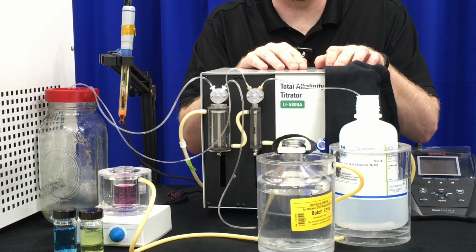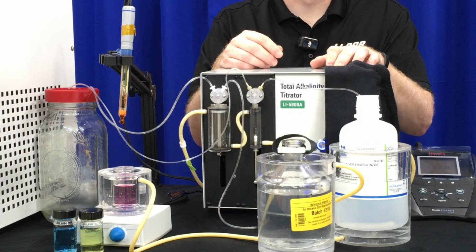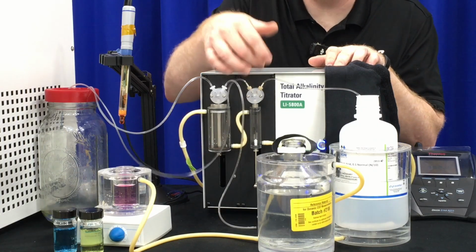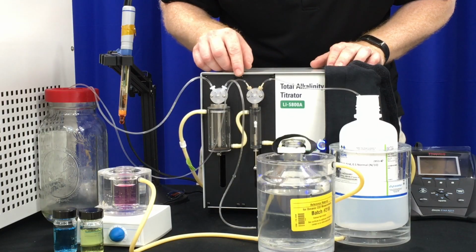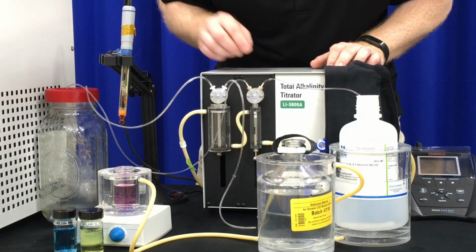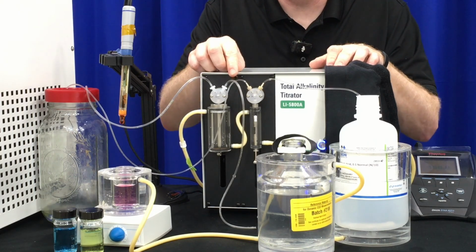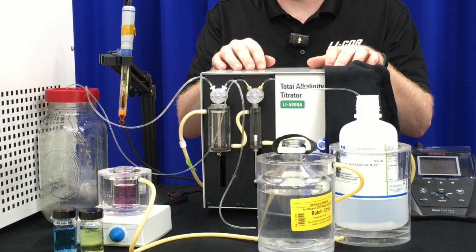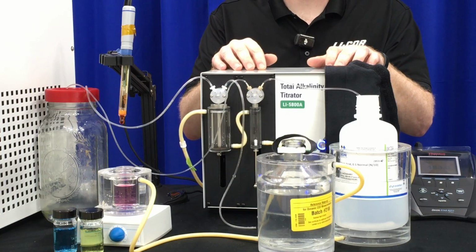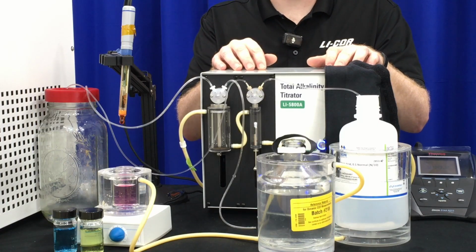And the syringe will flush with acid. As you see, the syringe is filling with acid, but there is an air bubble from the air that was in the tubing. And then it is dispensing into the waste container, but you'll end up with bubble lines in that line as well. That's why we do 2 flushes. The second flush removes all the bubbles out of the lines. As you can see, the second flush is now pushing everything through and out into the waste container.